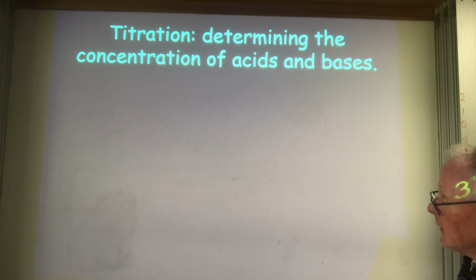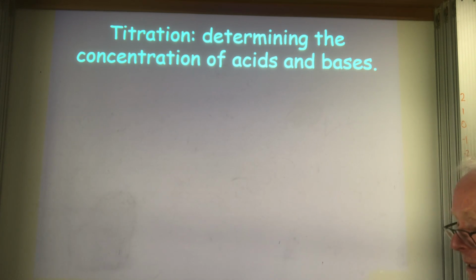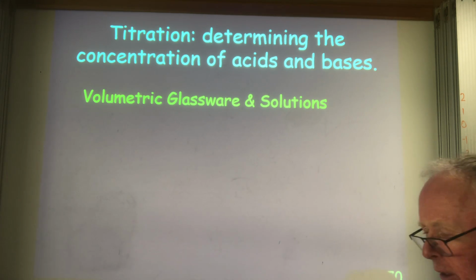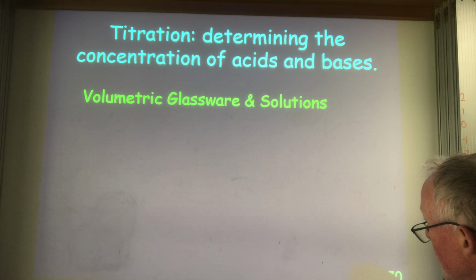Okay, again, applications of stoichiometry. This time, this is the more practically focused topic. We'd be doing a titration if we were in class. Now, understanding these questions means you need to understand the glassware.